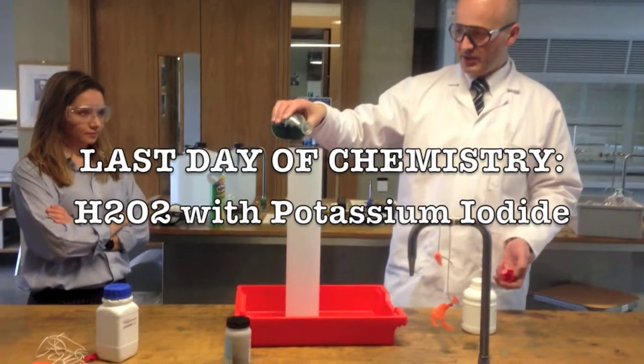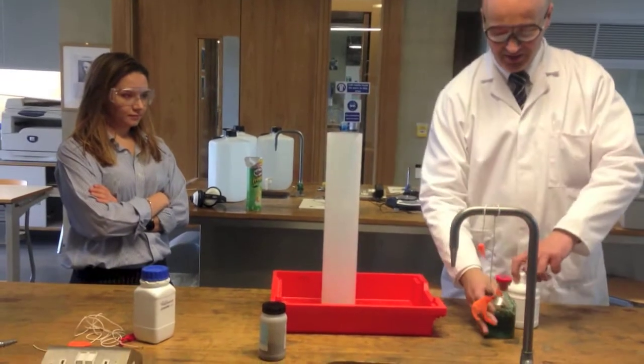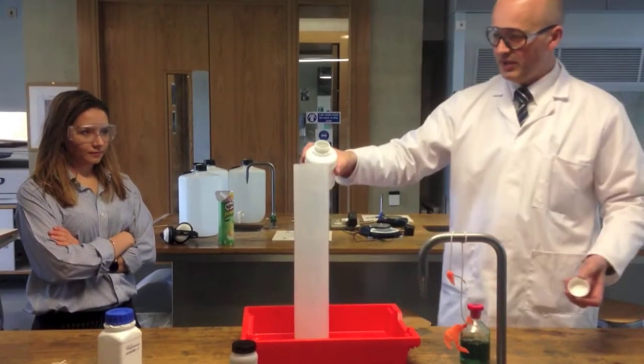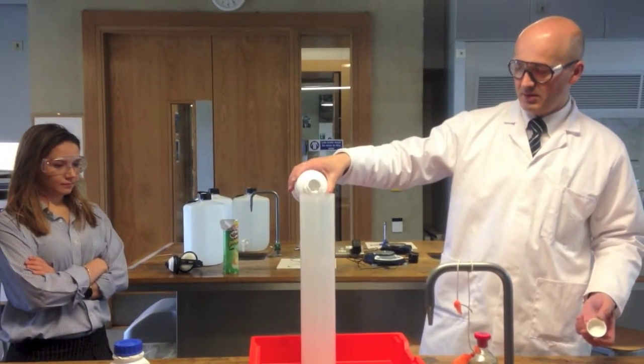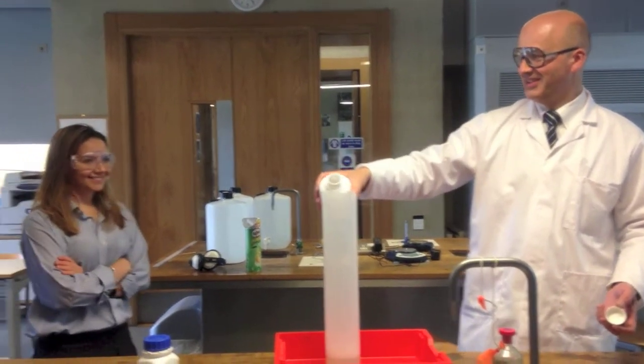I think a little portion of water to start. And 100-volume hydrogen peroxide — this is very corrosive. That's a lot of 100-volume hydrogen peroxide, so I put a bit more in there.